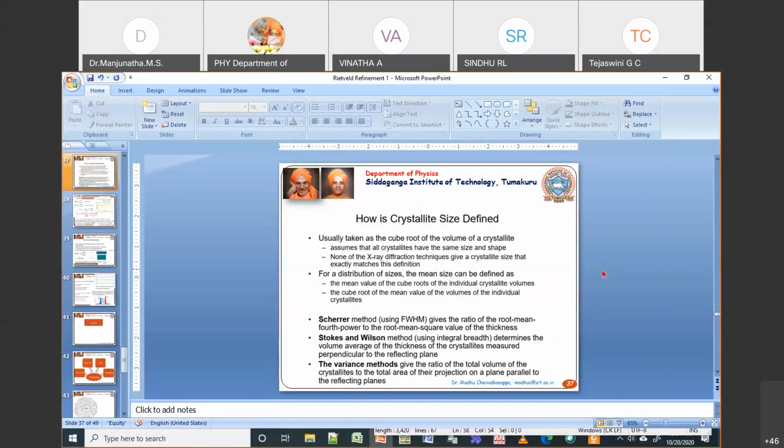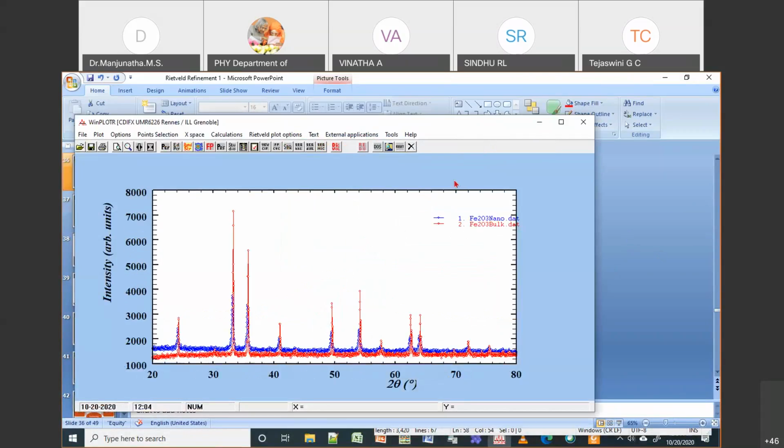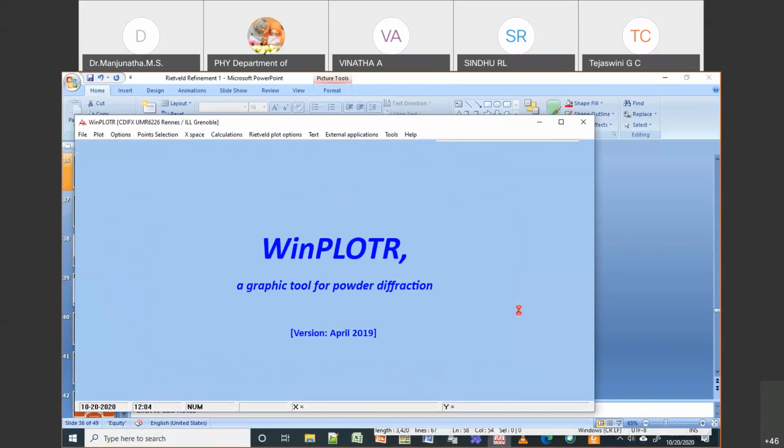So someone who may not know may make this kind of mistake, but as you are already doing good, quite good refinement now, you should avoid those kinds of analysis. Okay, so the reason why I showed you these three examples is how to get this FWHM.